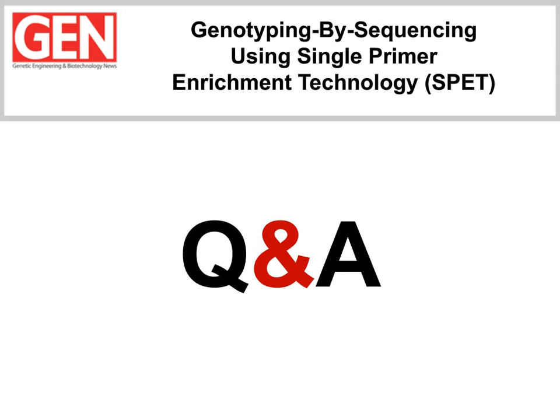And David, someone asked, could you provide a more detailed explanation of the deduplication removal process? Yeah, like I said in the previous question, the deduplication happens by looking at every forward mapped read, which is generated by random sonication, so the likelihood of generating reads that start their mapping coordinates at the same nucleotide is very low, but it can happen in very deep coverage situations.